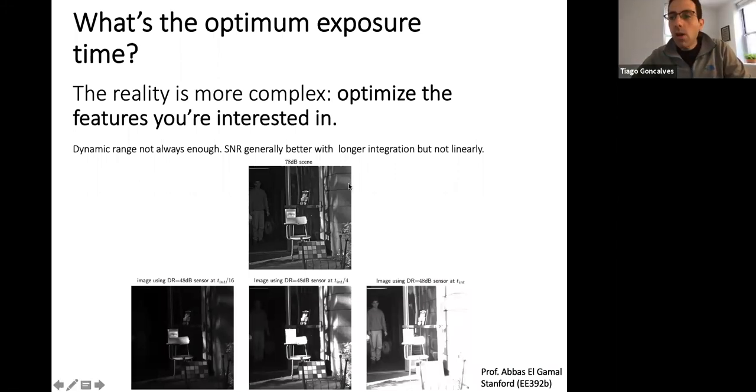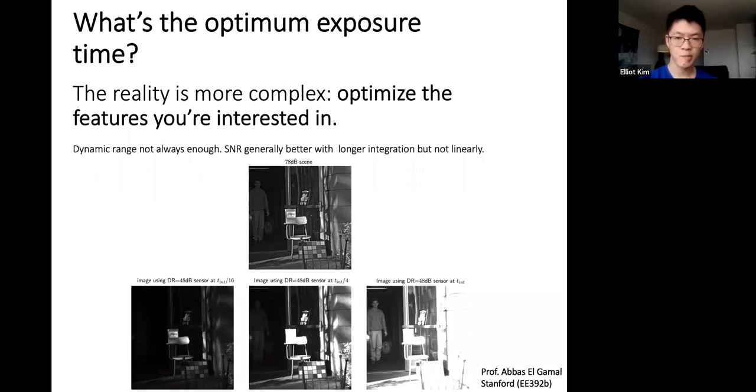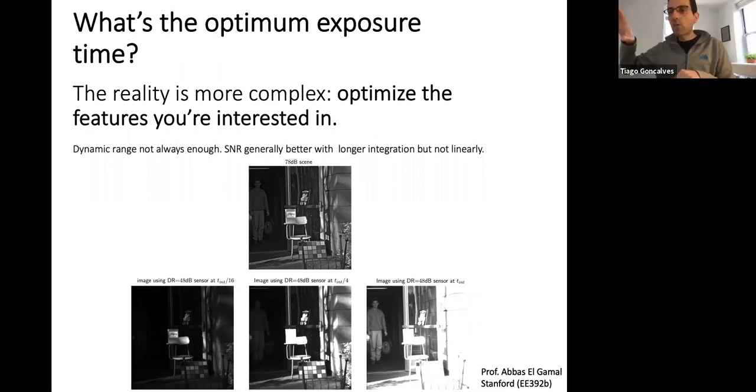But very often the sensor that you're using doesn't have the dynamic range to capture this whole range, because it may be that in a sample you have something that is very, very bright, and that's not what you're interested in. And it's impossible to get that very bright thing to be not saturated, and then your process of interest to be visible within a reasonable use of your dynamic range.